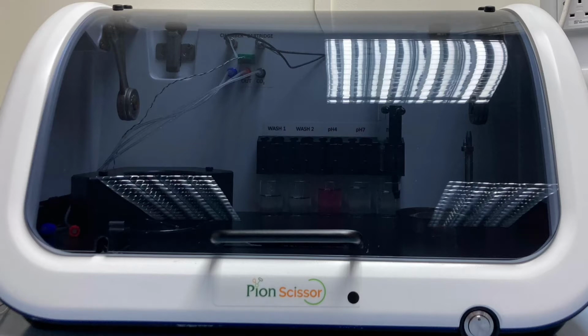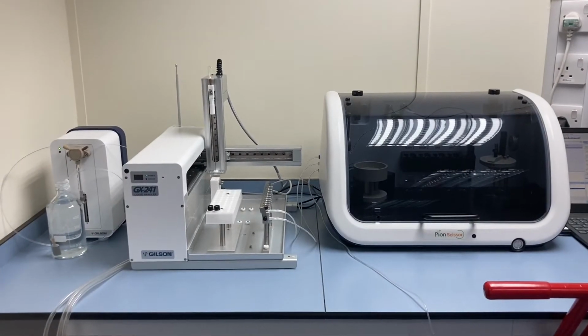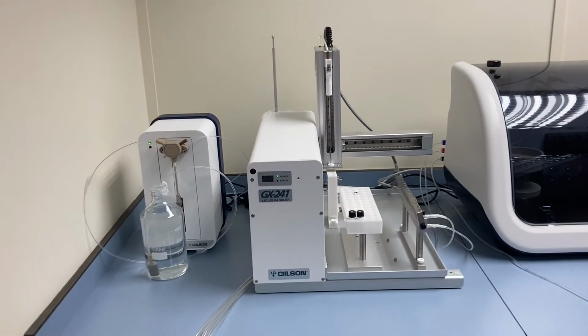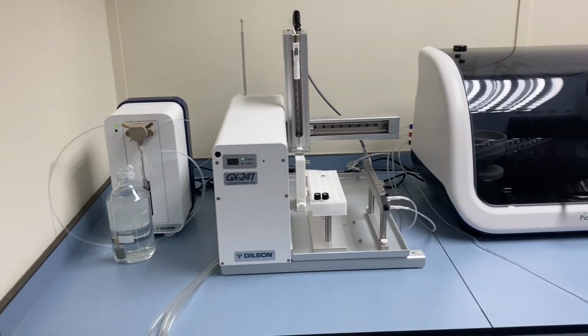This is the SCISSOR system. By its side we have the Gilson autosampler, which allows us to take aliquots of the chamber buffer at time intervals during the assay, which we can take for offline analysis to quantify the drug release per unit of time.